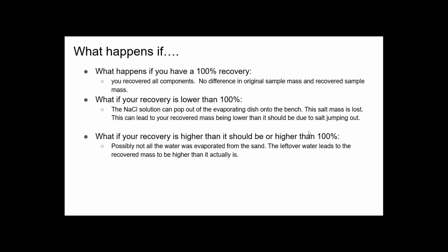So the salt mass is lost. It's going to mean your recovered mass is lost. And then when you do the percentage and set it up, you're going to have lower than 100%. What if your recovery is higher than 100%? And that does happen. It does, absolutely.